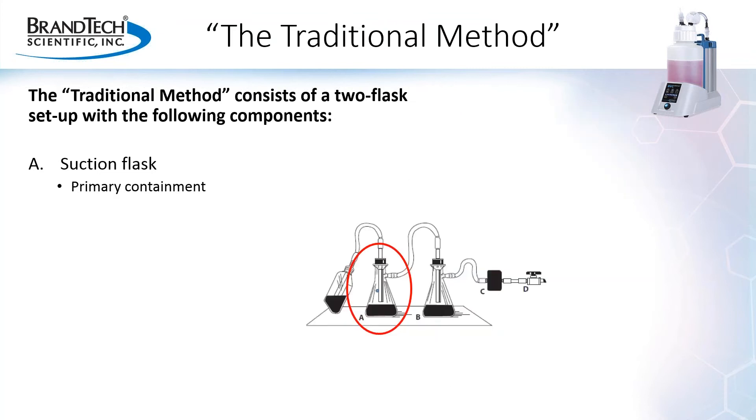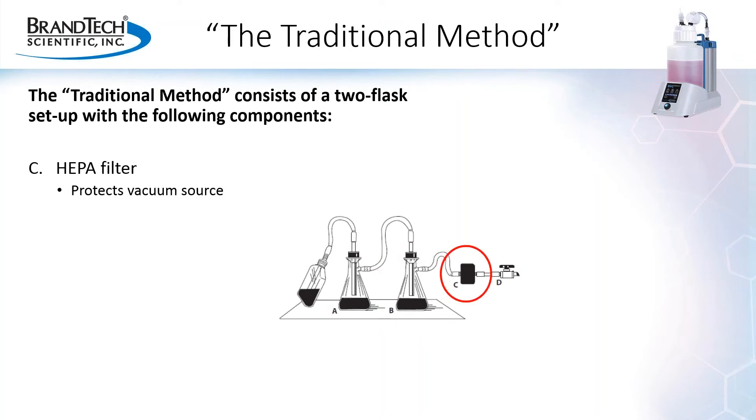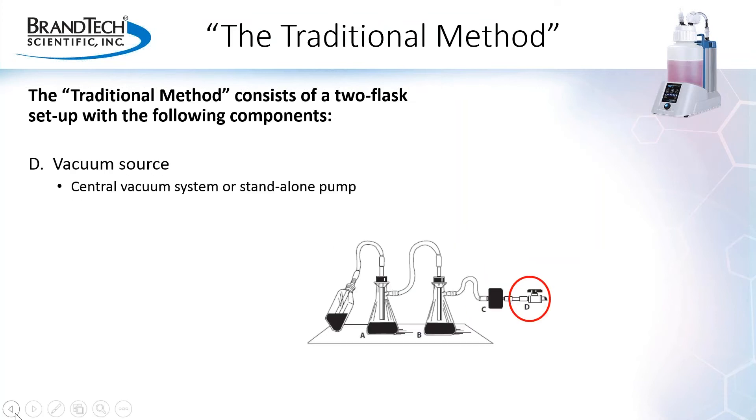The purpose of the suction flask, A, is to provide primary containment of the aspirated liquid, while the overflow flask, as the name implies, is for backup protection or secondary containment in case the suction flask overfills. The HEPA filter is recommended in line between the flasks and the vacuum source to protect the vacuum source from biohazards, mainly aerosols that can be produced during the aspiration process. And the vacuum source, which can be either a central vacuum system or a standalone pump, provides the vacuum that allows the process to happen.